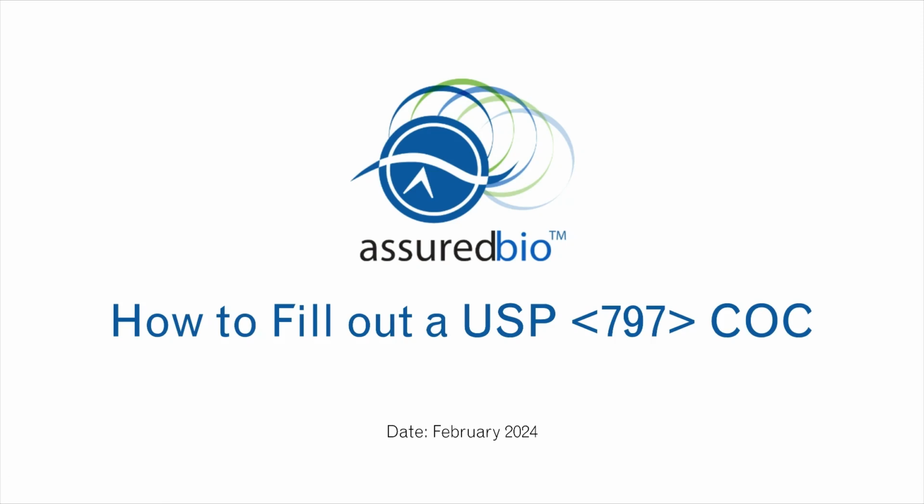The purpose of this video is to provide instruction for filling out a USP797 chain of custody form.